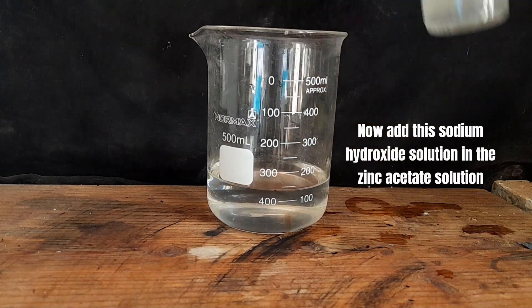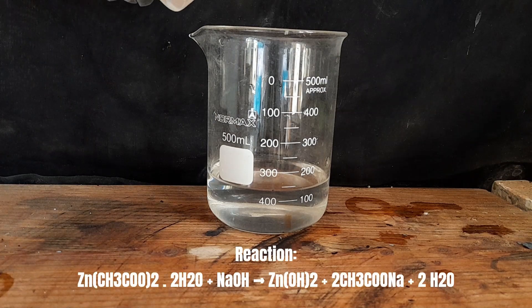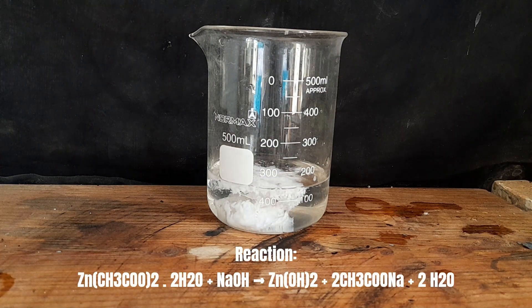Now add this sodium hydroxide solution into the zinc acetate solution. Sodium hydroxide reacts with zinc acetate and forms sodium acetate and zinc hydroxide in the form of a white precipitate in water.